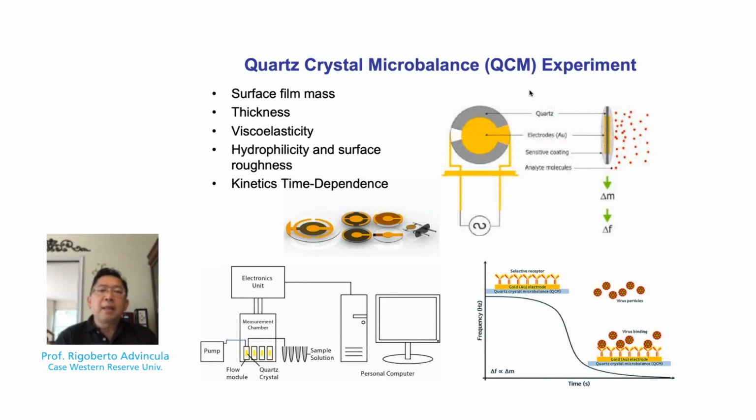The QCM, as an electrode or a transducer element, can typically be attached together with an evaporated gold on the surface or pattern, enabling one to measure the frequency shift as a function of time, or frequency change as a function of loading of mass, or investigate the viscoelastic nature of films.